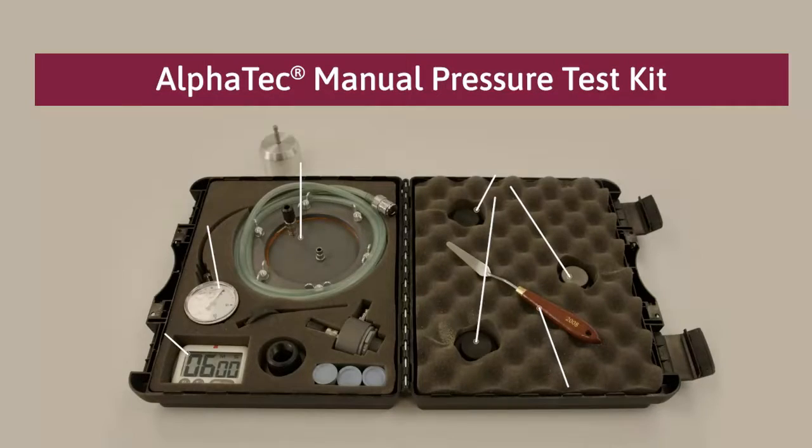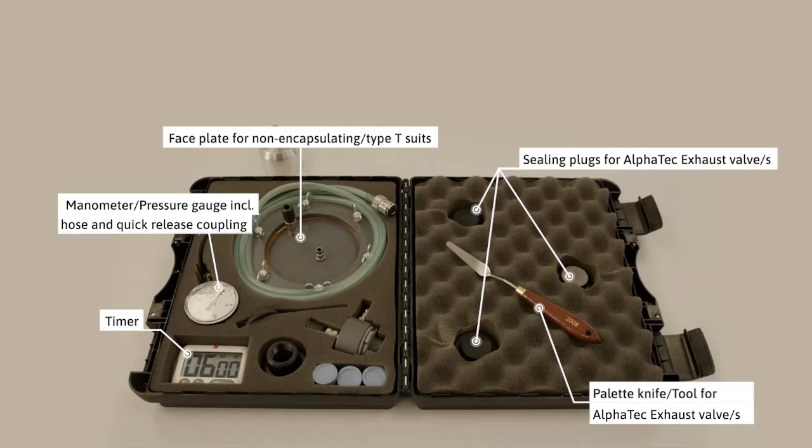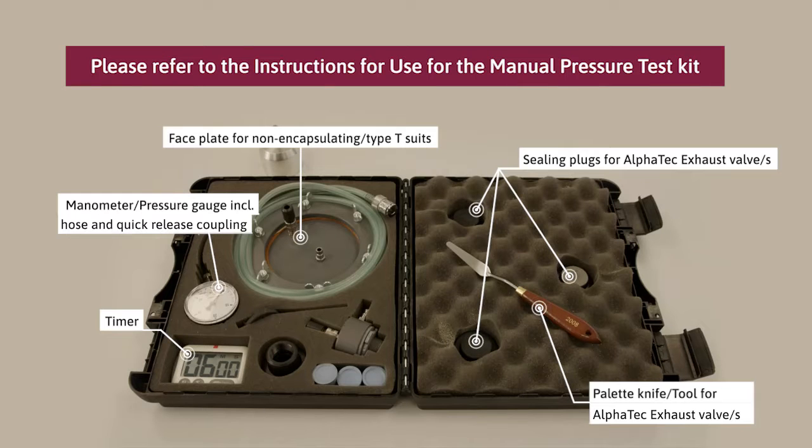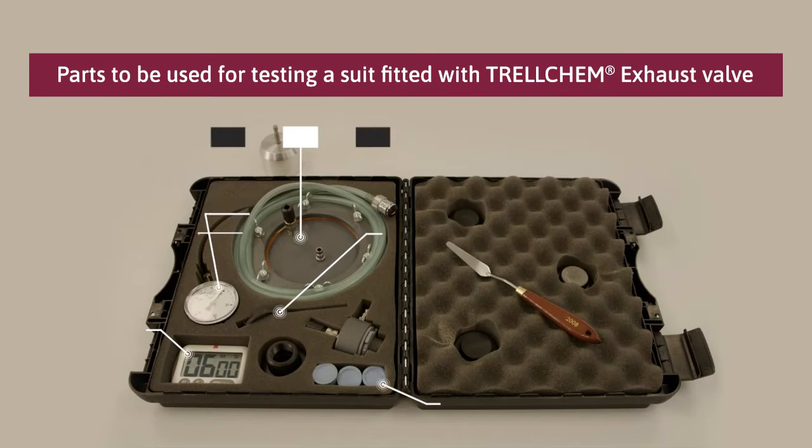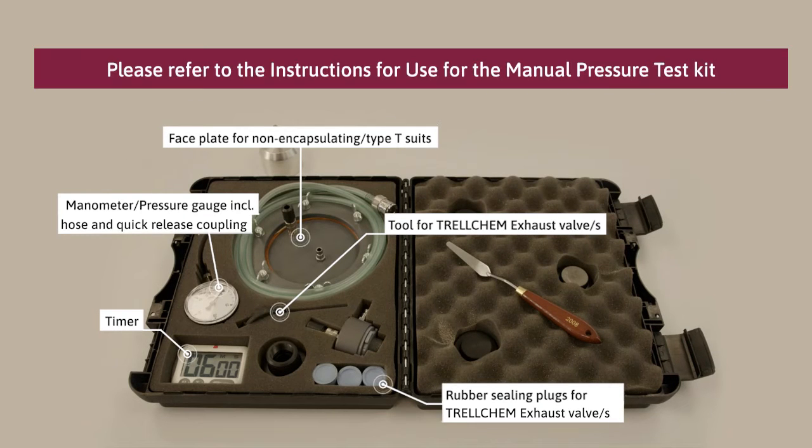Check the content of your test kit to find the correct components for the pressure test. If you have an older suit fitted with the Trelchum exhaust valve, these are the parts you need for testing.